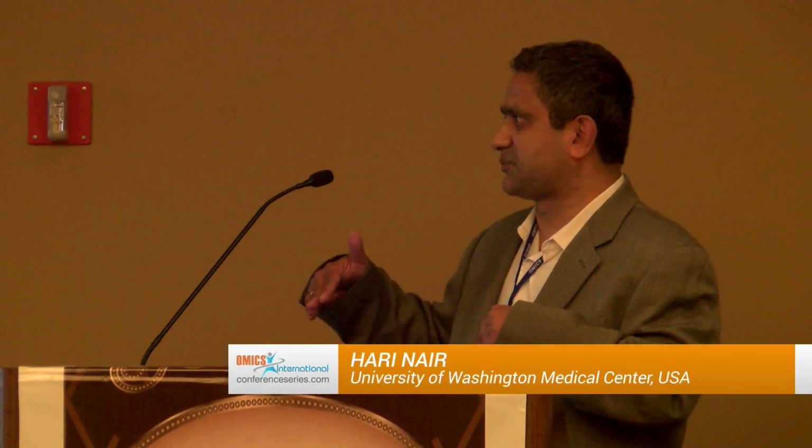So the pre-mortem samples, as you can see, 1, 2, 3, 4, 5, have significantly different profiles, and in the post-mortem samples, this difference is retained. In other words, there is significant difference between patients, but very little difference within patients. This is the type of information that we look for in the clinical lab. And a similar trend is observed in sphingomyelins, phosphatidylcholines, and ceramides.